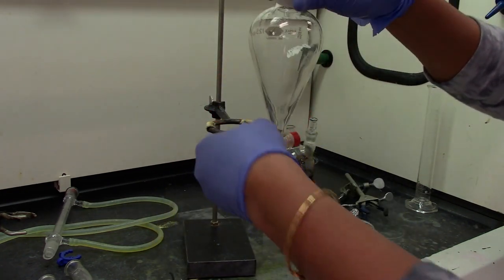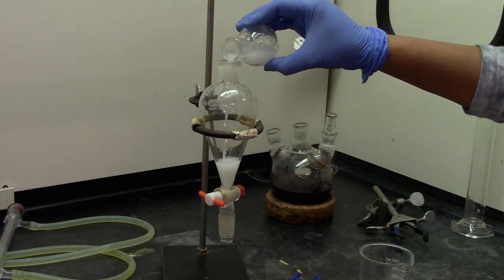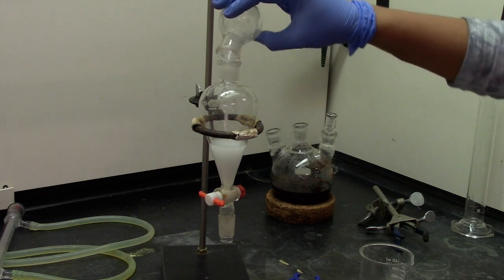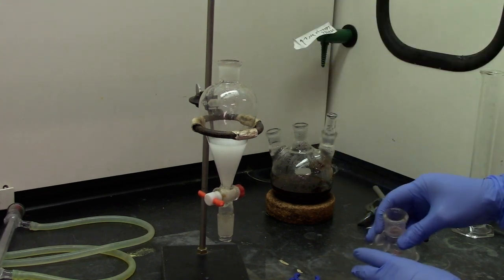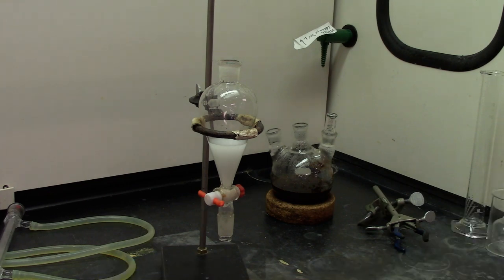Make sure the separatory funnel is closed before you add the solution. Pour the collected solution into a separatory funnel and add 10ml of dichloromethane or methylene chloride.